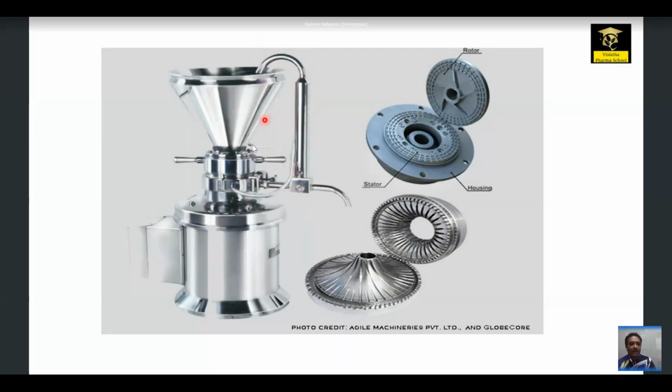So, cyclic number of cycles, the liquid preparation is subjected to size reduction. Suppose if you open it, the material will come through this feed outlet, and you can collect the solution into the feed bucket. And here you see the rotor, which, as I told you, is a dome shaped device. Can you see the grooves that were designed onto the conical dome shaped device?